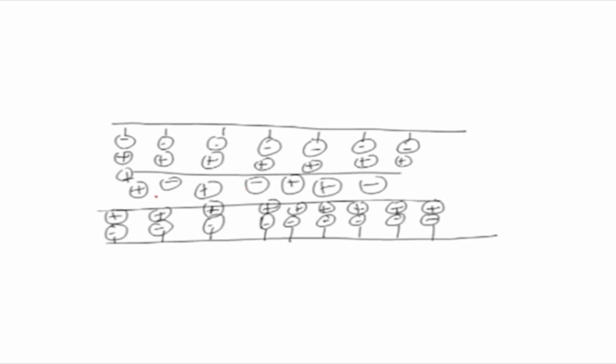The negatively charged ones will be aligning here, and when the voltage is applied, these positively charged ions will move towards the cathode, or negatively charged electrode. So when the voltage is applied, the ones attached to the wall all move, and some positive charge will move towards the cathode.